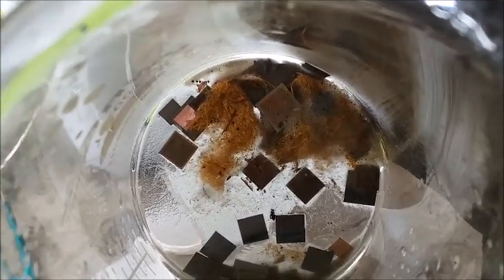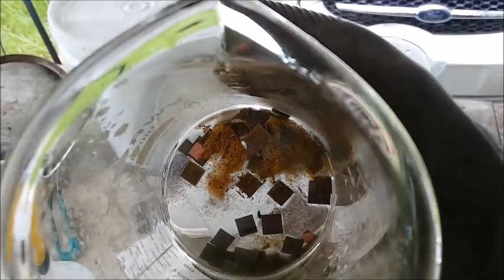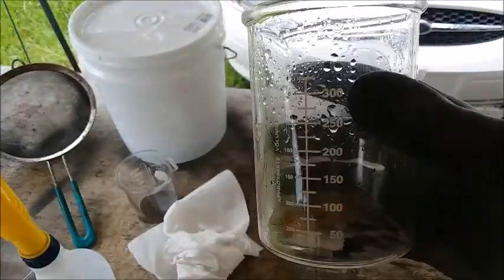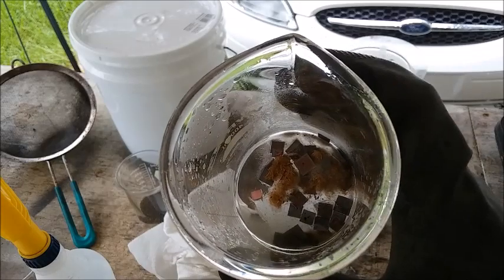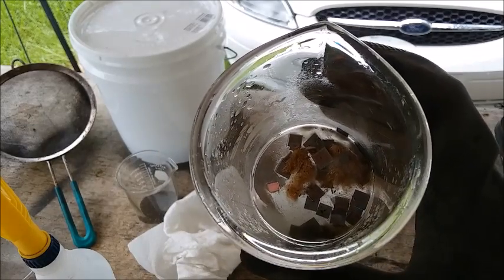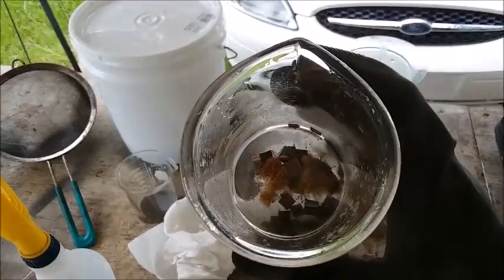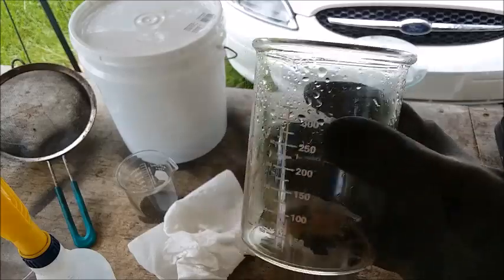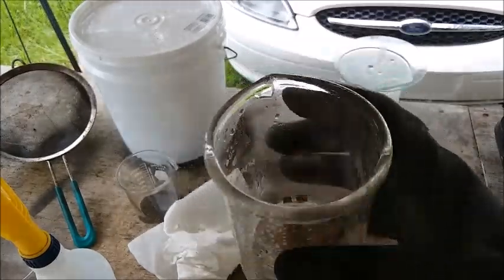All right, can you see all the gold down there in the bottom of the beaker? I've transferred everything to this smaller beaker because it doesn't really need to be in such a huge beaker anymore. In fact, that beaker it was in, I noticed, had a hairline crack in the bottom of it, so I've thrown it out. Not sure how that happened, but okay, I'll get another one. But this doesn't need to be in such a big beaker for the next step.